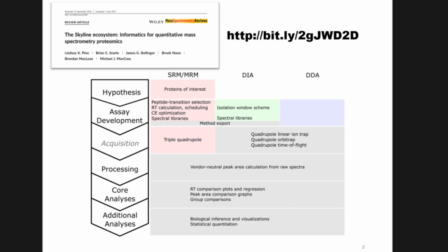And then the last phase of that tutorial yesterday showed you, well, what if you had a protein standard for each of those 6 proteins, and you analyze the protein standard? So now not only do you have every possible peptide that might exist, just the peptides that have a single MS-MS spectrum, because DDA will just give you that one single MS-MS spectrum, the best one.